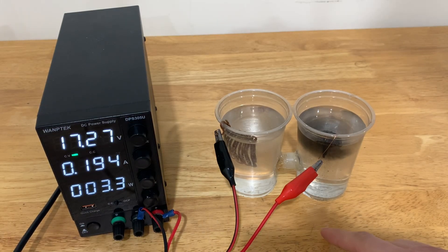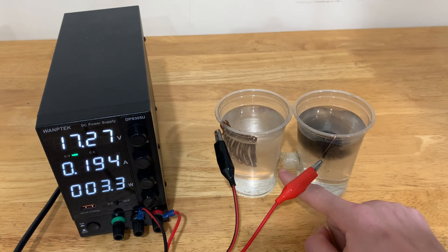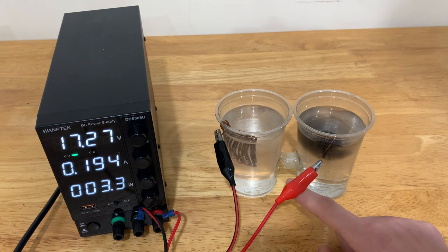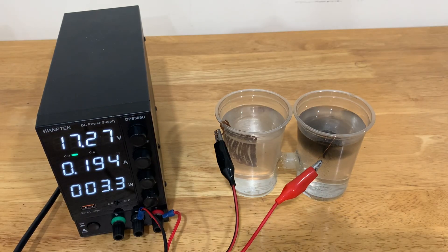And now I'll leave this thing working for eight hours, or at least until this part melts due to the high current and the fact that it's being held together by hot glue. So I'll leave this thing running for about eight hours — I'll be back then.